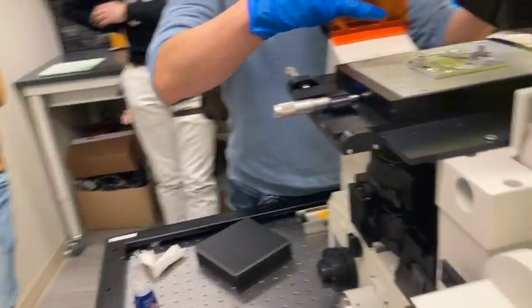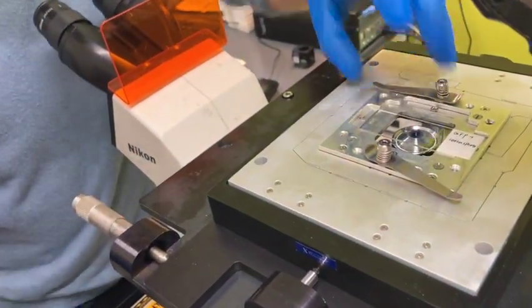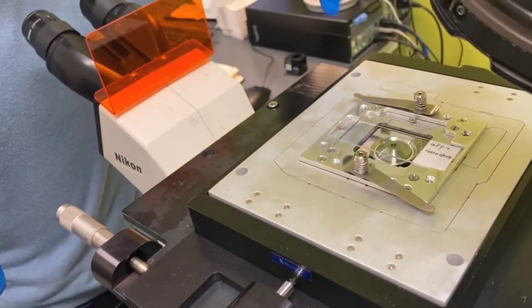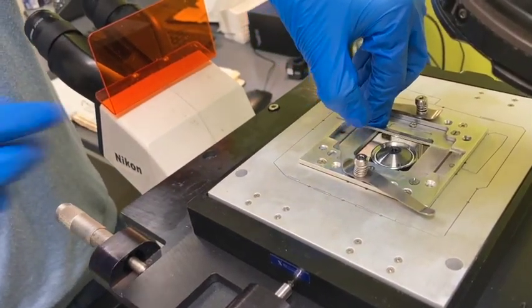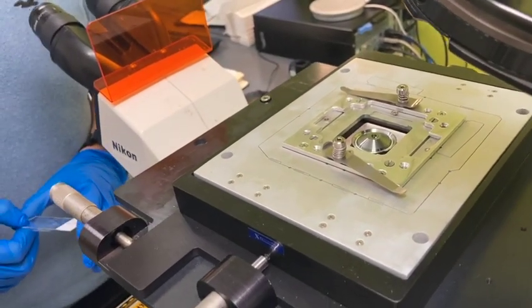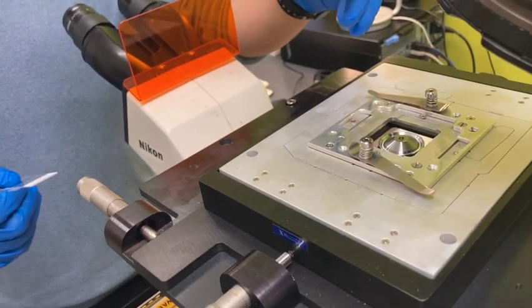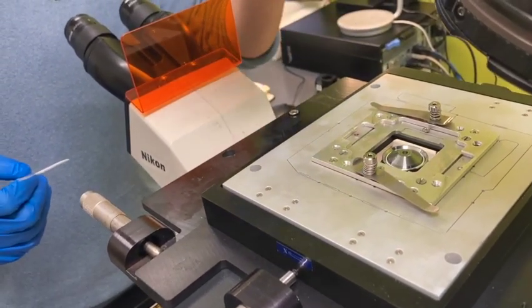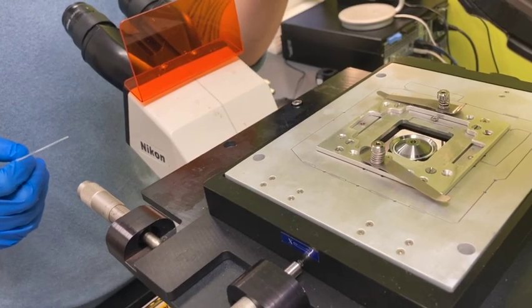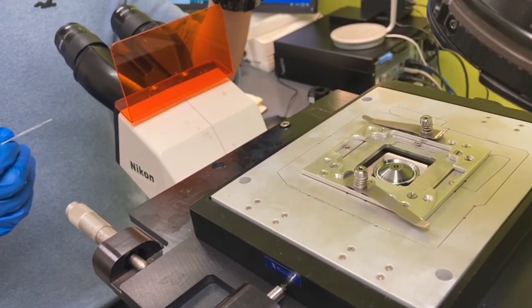And then we just remove our sample gently. Sometimes I need tweezers, but that's another thing that might damage your objective, because we know that the objective is made of very hard glass, quartz or something, or blue stone.